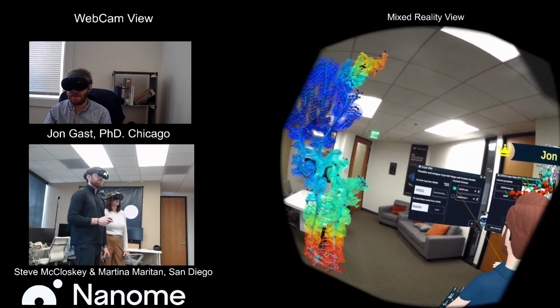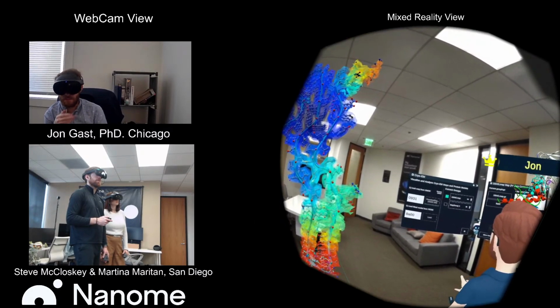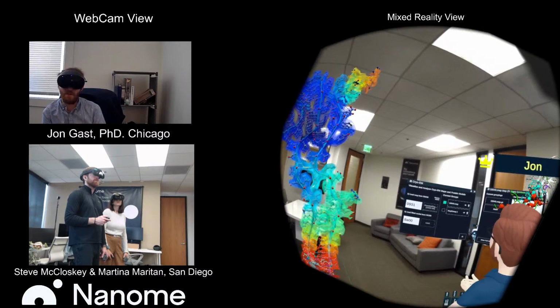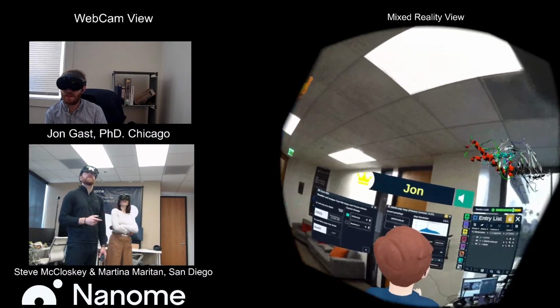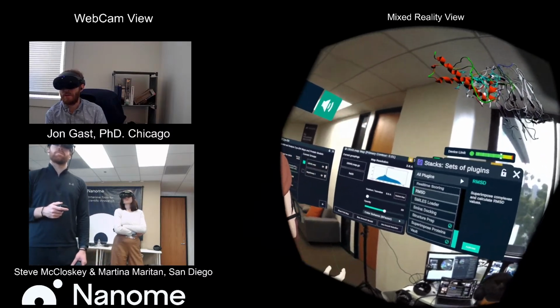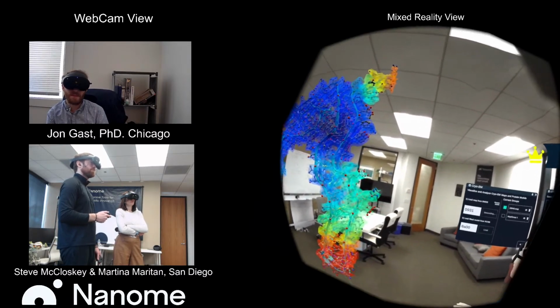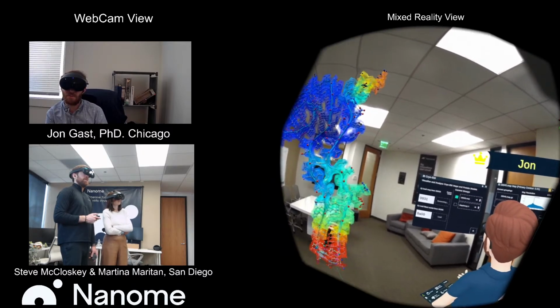So I'll start downloading that, but essentially you'll have map groups. And if you want to align map groups, you can. There are some ways of doing it, but obviously the more similar the proteins, the easier they'll be to align. But for these, typically what I would do is actually use the RMSD plugin, just because it'll allow you to bring both the proteins and the maps together as you bring them in.